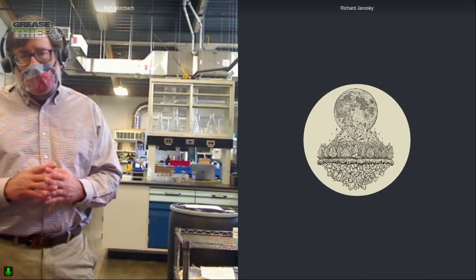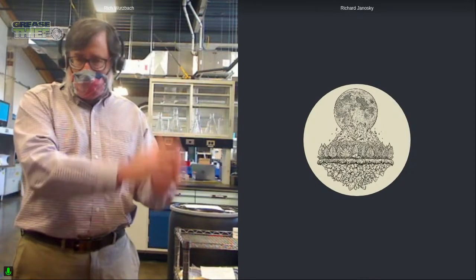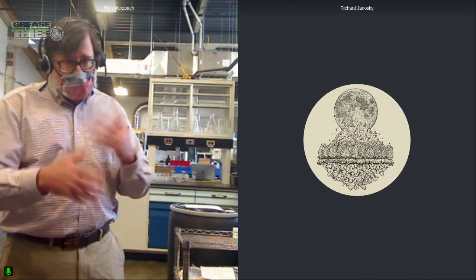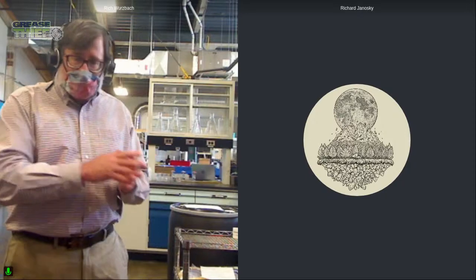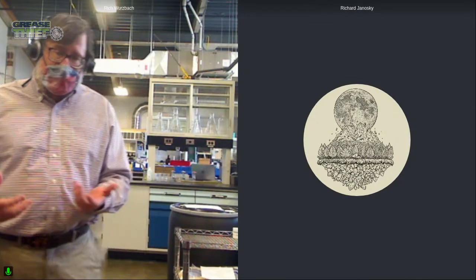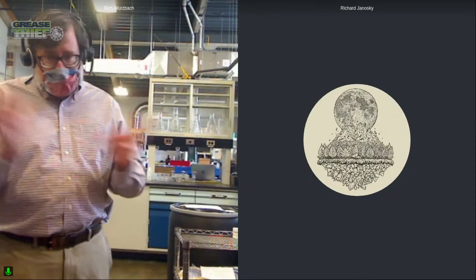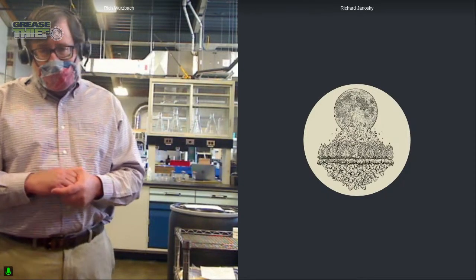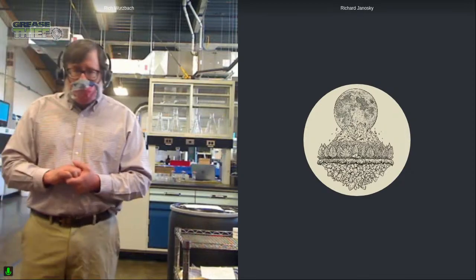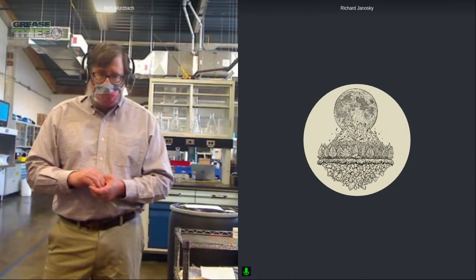You just really have to know the condition of the grease going into the machine, through your autolubers, through your grease guns or whatever, and then compare the samples that you're getting to that starting point. Because there are formulation changes over time, re-updating and rebaselining those greases is a very important strategy. To assist with that, we don't charge to baseline a grease. We just ask the customer periodically to send us some updated grease so we can get that baseline current and valid. I hope that addresses that question. You extrapolated perfectly, and that was what he was looking to get.